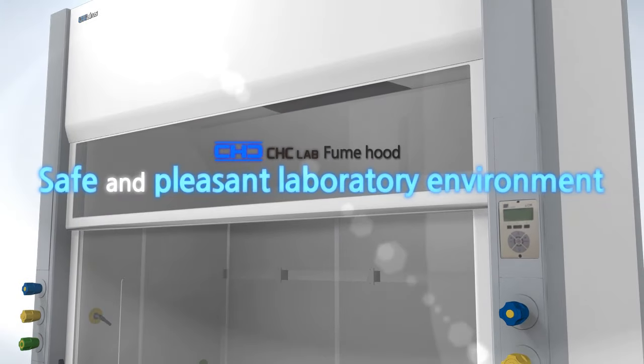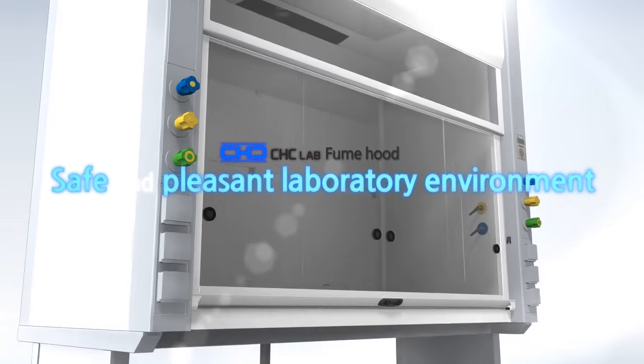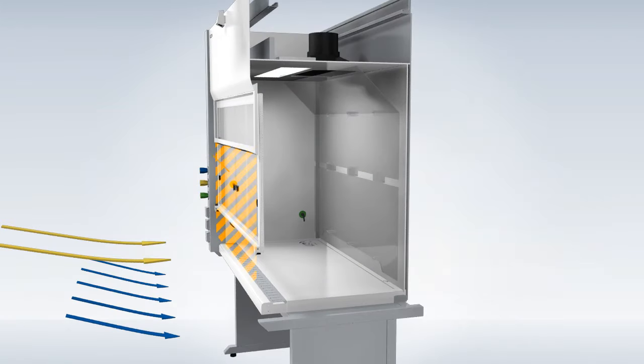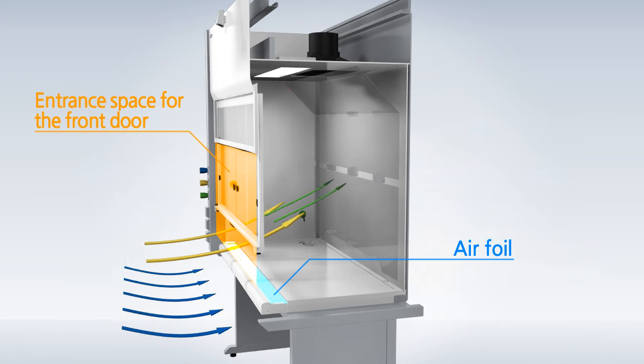The fume hood is an essential piece of equipment to create a safe and pleasant laboratory environment. When a blower connected to an HVAC system is activated, air starts to flow inside the fume hood.